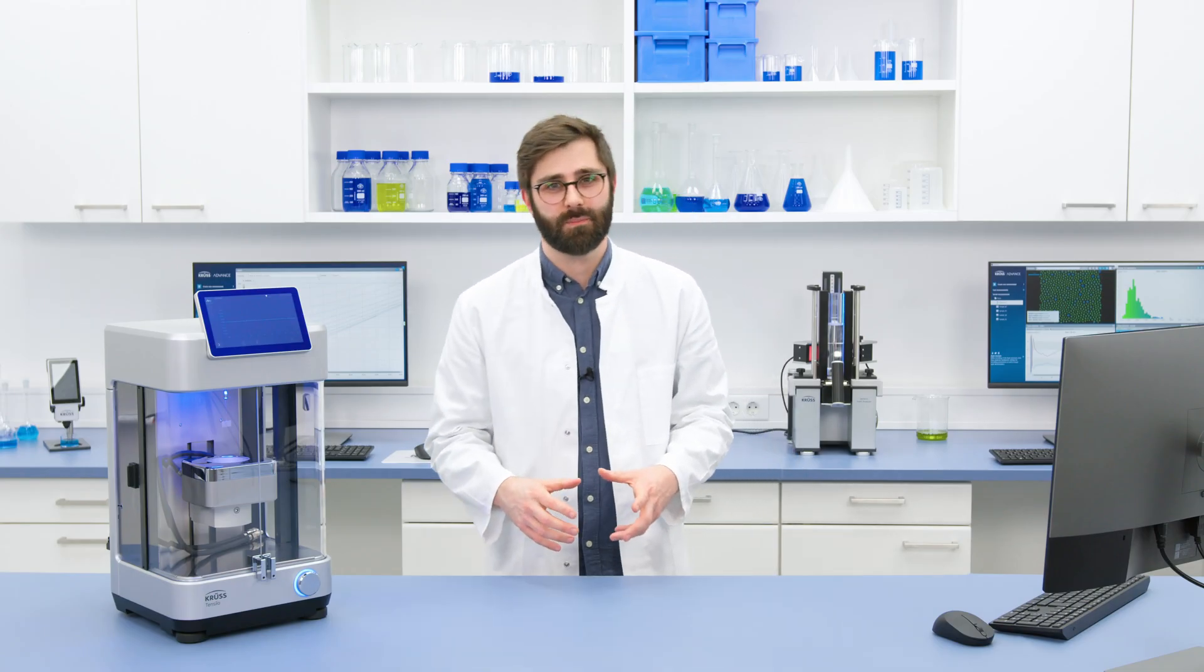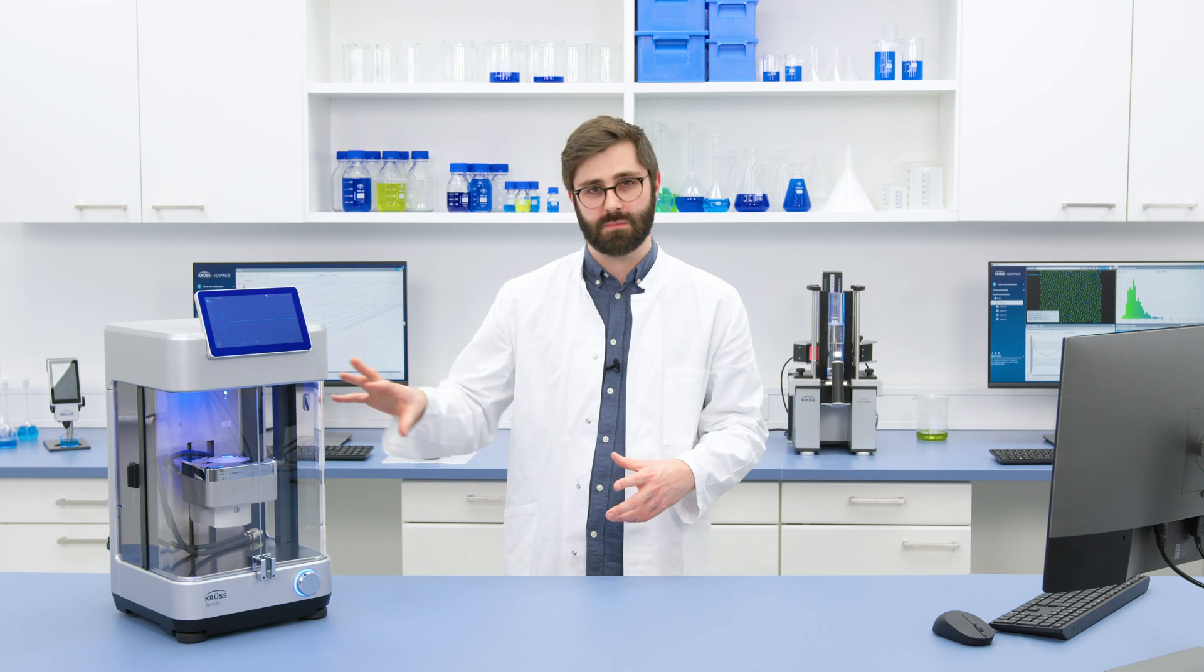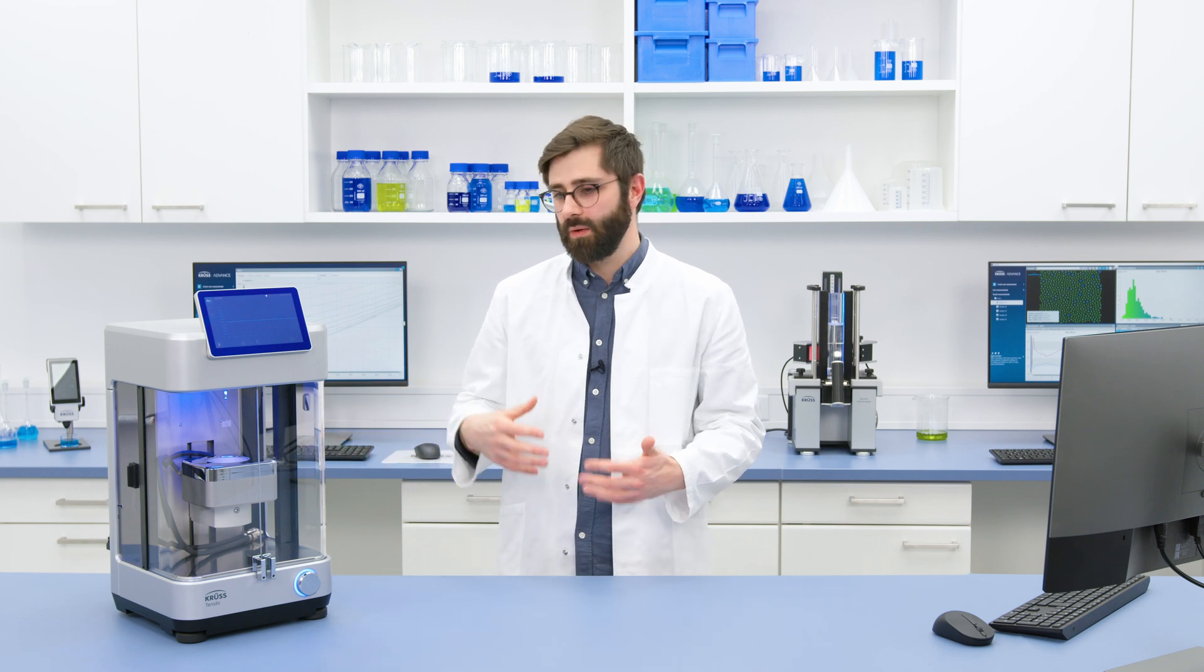Now I've talked a lot about the configuration and the flexibility of Tensio, but one thing that's important to think about is also how the history of a tensiometer is very closely bound to the history of Kruse itself. So naturally when we release a new flagship design like Tensio, we make sure it has all of the best specifications we can give it.